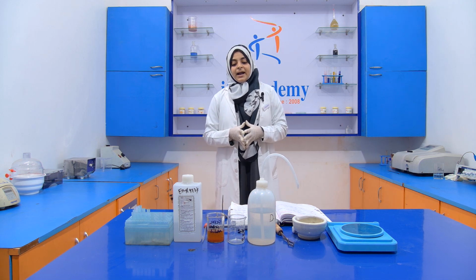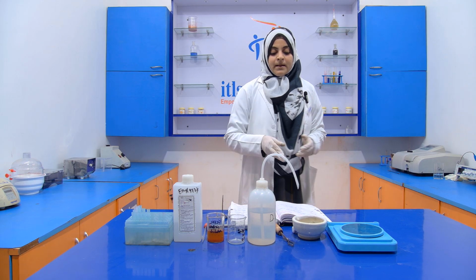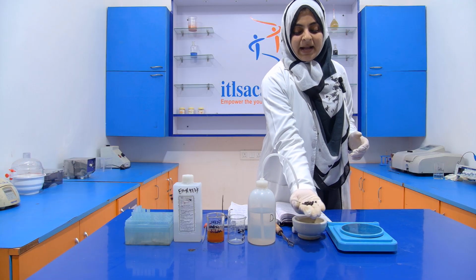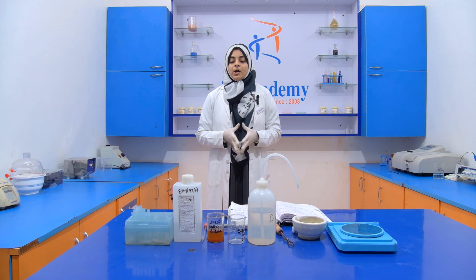So here our adulterant is what? The adulterant is papaya seed, and the food sample is black pepper. So we have black pepper as a sample, and we have to see whether any adulteration of papaya seed occurs or not.